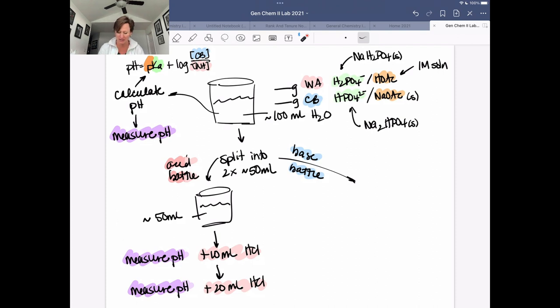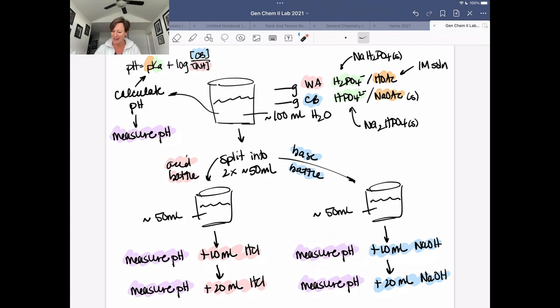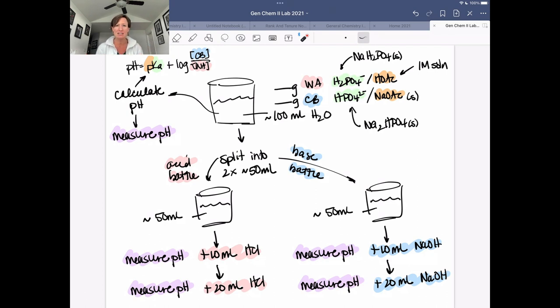For the base battle, take the other 50 mL portion and add 10 mL of sodium hydroxide, then measure how the pH changes. Adding sodium hydroxide, a base, we should see an increase in pH. Then add double that amount, doing an even bigger battle, and ask how that buffer system is able to control changes in pH. Buffers don't prevent pH changes — they buffer or mitigate the magnitude of that change.